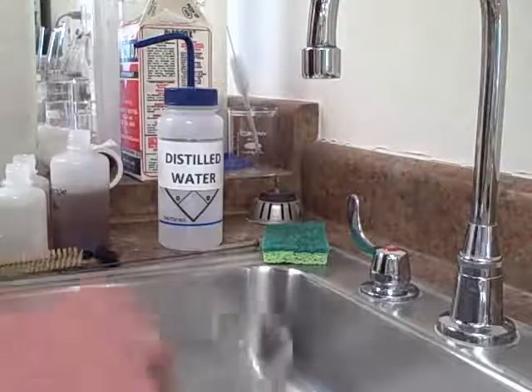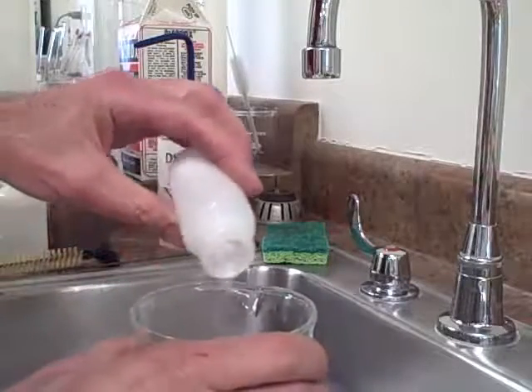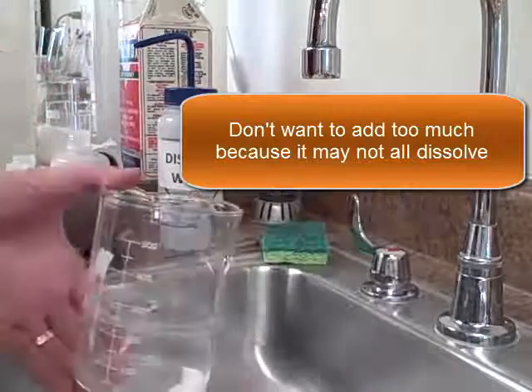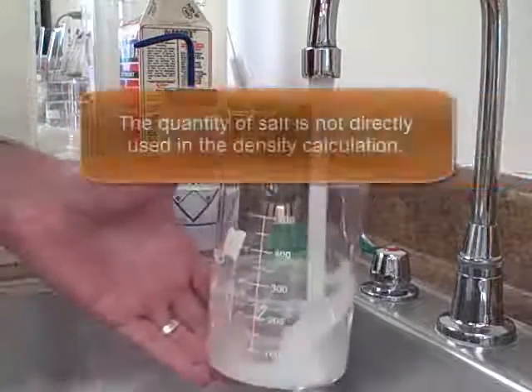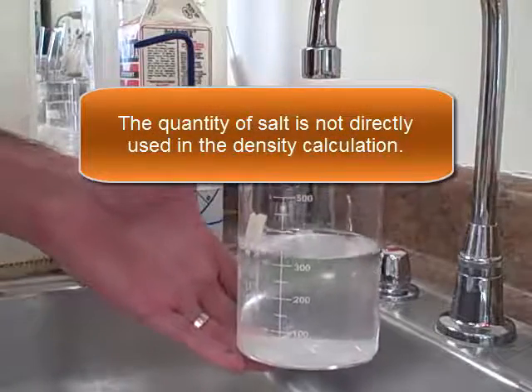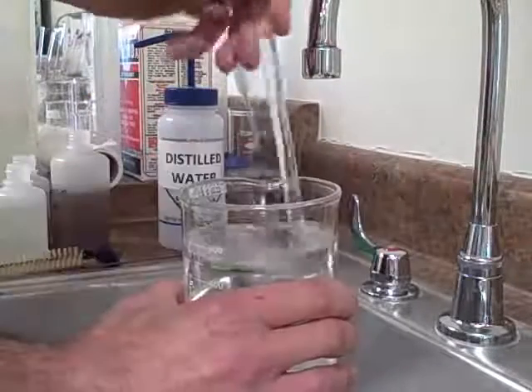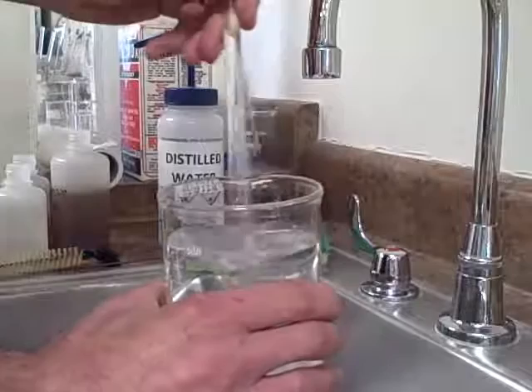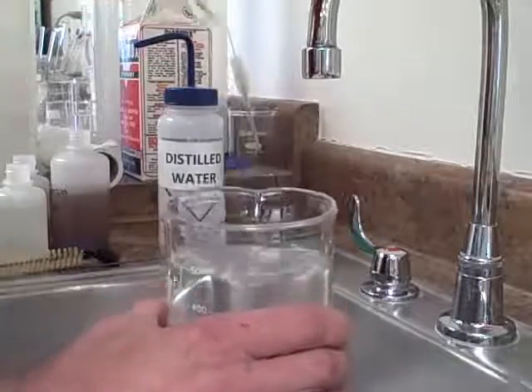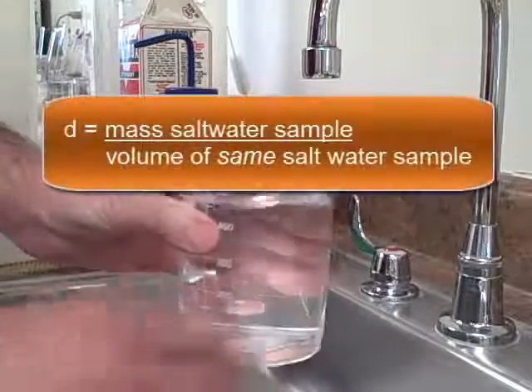To prepare the salt water, I'm just going to add a small amount of salt. This amount of salt should be sufficient, as you can see there. I'm just going to use tap water to dissolve it and make about 500 mils. That looks about good enough. And now we're ready to determine the density of the salt water solution.